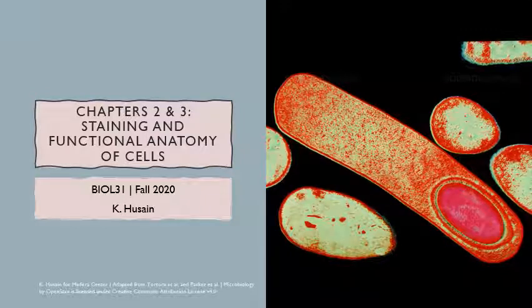Everyone, this is actually the lecture for Thursday, August 20th. I'm posting it a little bit early so that hopefully you can at least look over the slides before Thursday's lab. So during week 1, the first lab was on basic aseptic technique and microscopy. The second lab is really about staining.